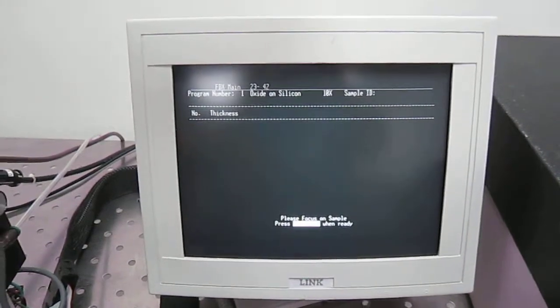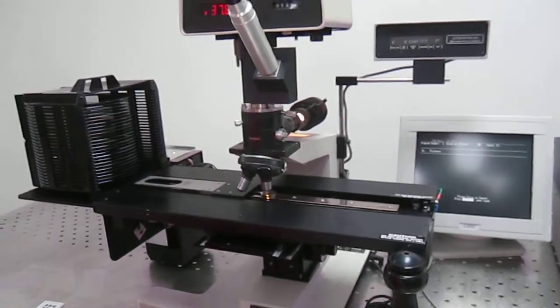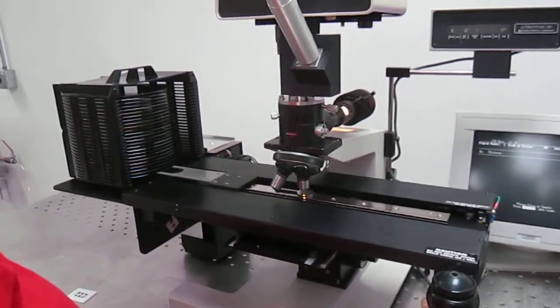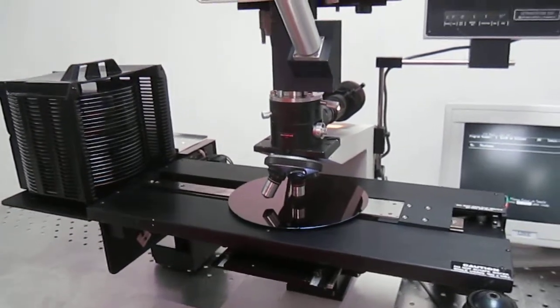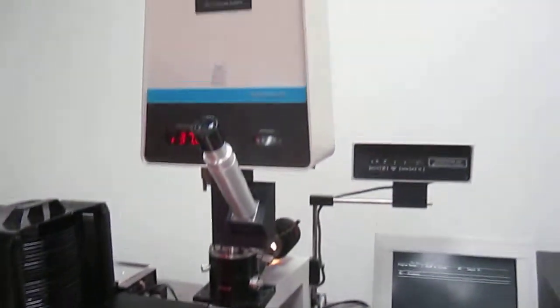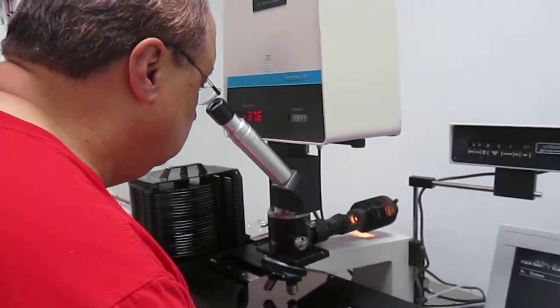This is ready to make the measurement. Don's going to go ahead and initiate. This is a 964 angstrom oxide on silicon.